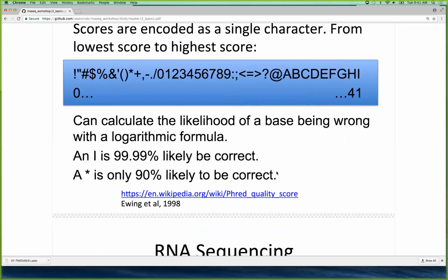Oh, well, they take genomes that they know that they've sequenced to 1,000x depth, and they have a really, really good idea of what the actual biological reality is. And then they go back and they look at miscalled bases, which you can totally see. When we align reads to a genome in this class, you'll see a random base here or there that doesn't line up. You'll have like 40x coverage and one base in one read won't be right, and you're like, okay, that's an error. Then you can go back and map those instances to these numbers and see how good they did. And it's pretty good. It's not perfect, but it's pretty good.